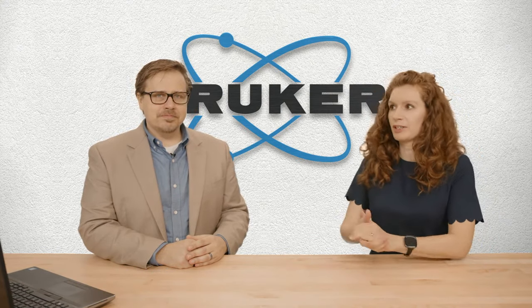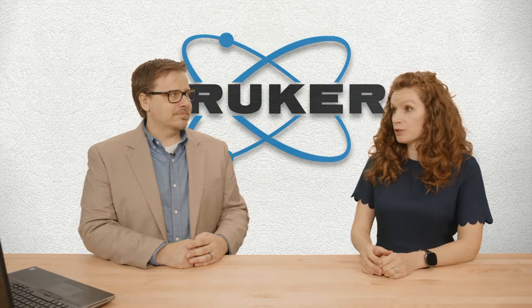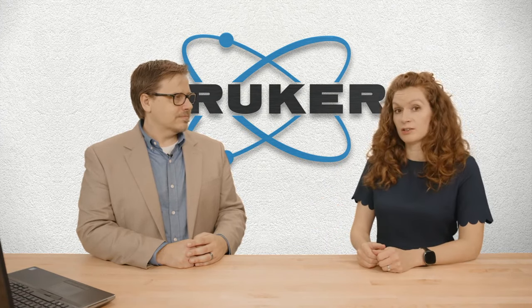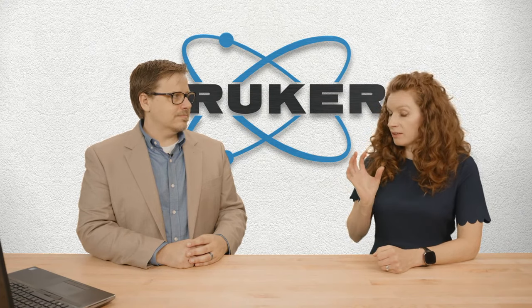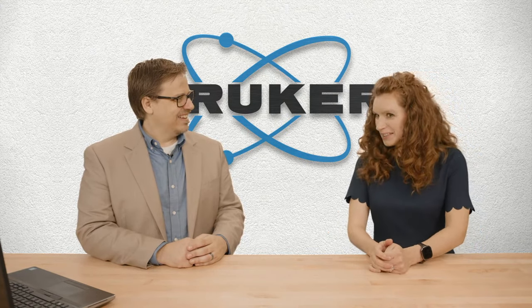So WDXRF means wavelength dispersive X-ray fluorescence spectrometry. You mentioned before we have EDXRF and WDXRF. Just a quick reminder, ED stands for energy dispersive. So we have a tube, a sample, and a detector, and all of the resolution and the intensity is determined by the detector. With wavelength dispersive, we have a tube, a sample, and then we have optical components, namely the collimator and the crystal, that will help with the resolution and with the intensity. And so the crystal is there to diffract into the whole angle, and the detector goes around that angle and determines what element is present. Okay. It's a little technical, but you can either look at the old video, or I can go into more detail a little later if we have any specific questions.